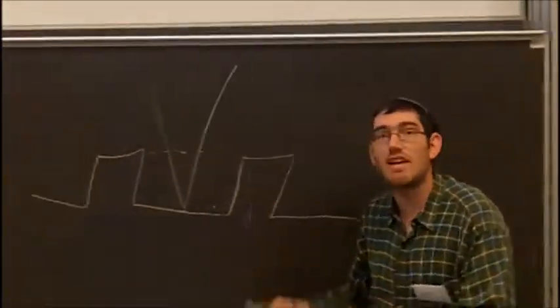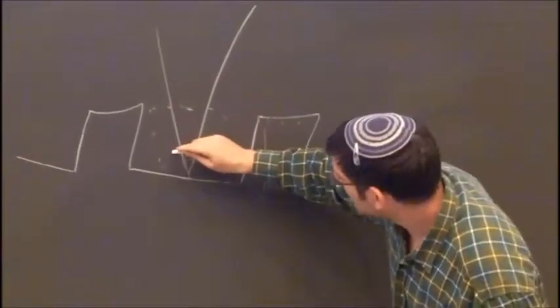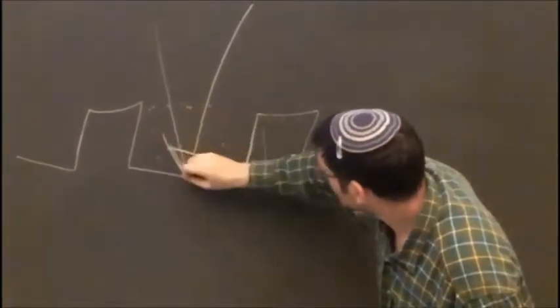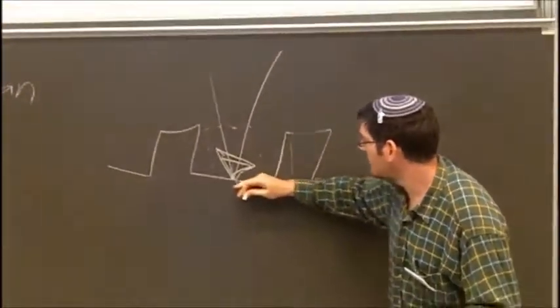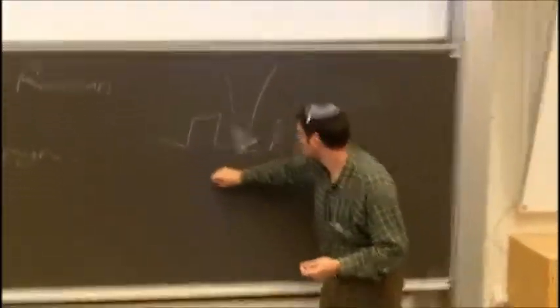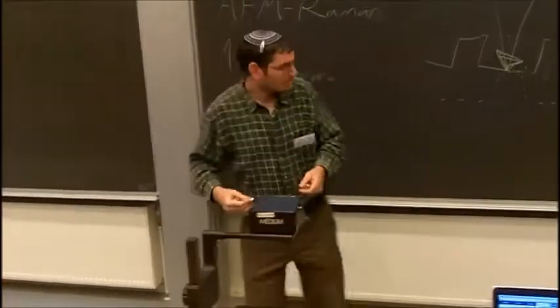By using AFM together with Raman, we have a probe which is now probing at the same focal point, so we have a probe here. When this area comes here, the whole scanner will come down, and the sample will look like this. So by using AFM feedback, we also get more information and a more correct Raman spectrum.